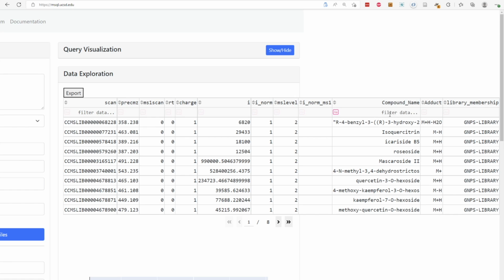We can also Google all these other compounds and look at their structures, and they actually have a hexose in there as well. That gives us a lot of confidence that this MassQL query, looking for the 162 Dalton neutral loss, is finding what we initially aimed to find, those hexose-containing compounds. So it seems to do it reasonably successfully in this sandbox.